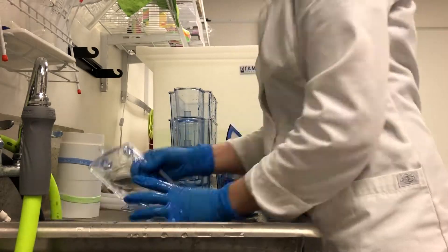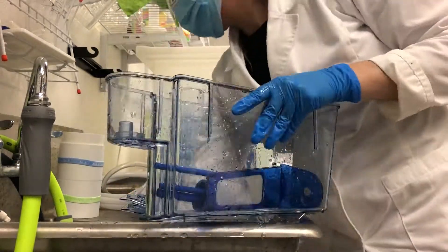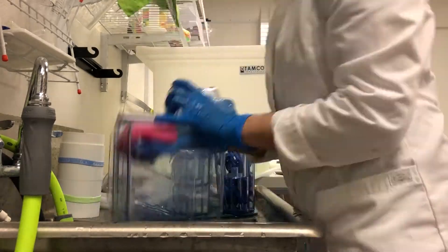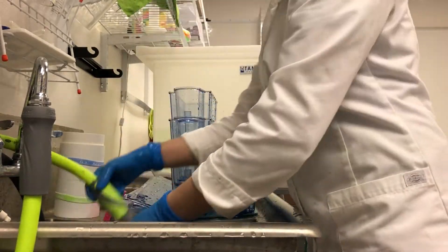We start by cleaning any excess debris off of the dishes using a soft sponge or cloth. We can use tap water at this stage and we will put them into the bleach.